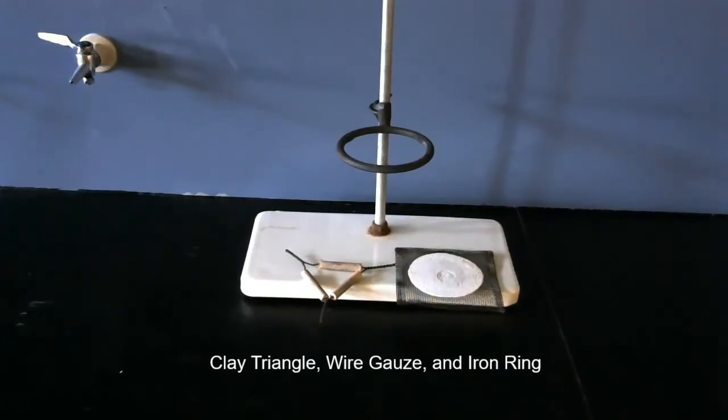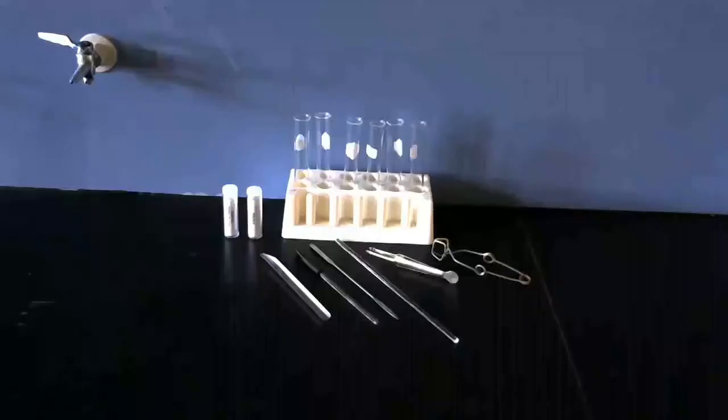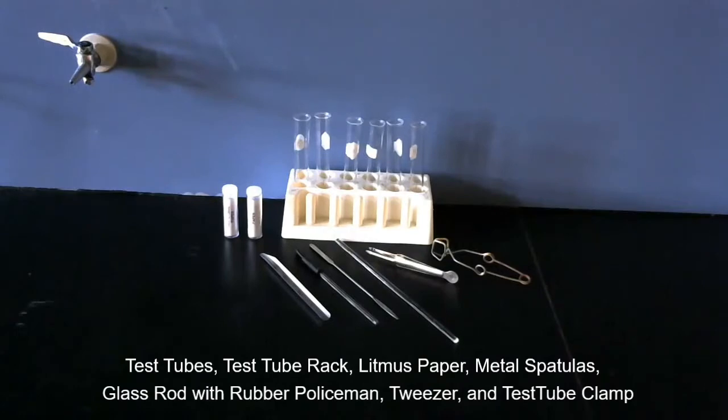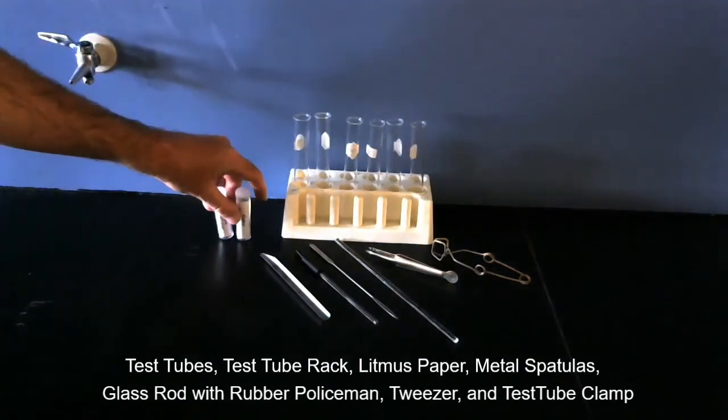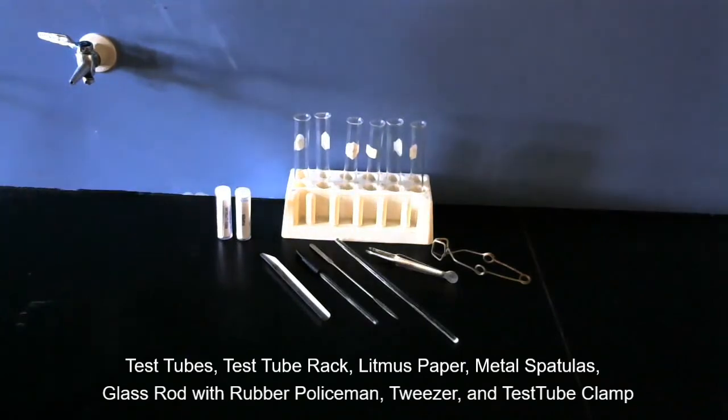What we've got there is a test tube rack in the back with test tubes. We got red and blue pH paper that come in little tubes like that. If the blue turns red, it's an acid. If the red turns blue, it's a base.